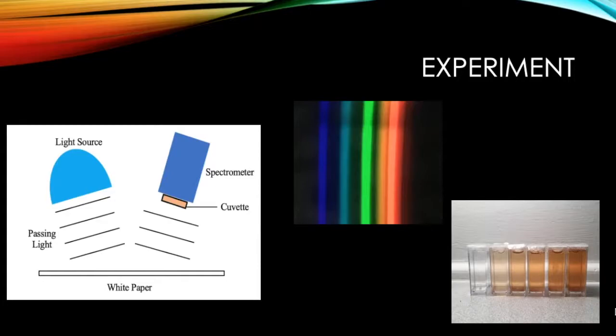In experiments where no diffuser was used, the spectrometer had too much light inside the body and images were washed out. Solutions were prepared from one strong batch of tea steeped with distilled water. Using distilled water eliminated impurities from tap water which may influence absorption. To then obtain the various solutions, the tea was diluted with additional distilled water by a certain percentage. This eliminated differences that could have occurred in the brewing process.